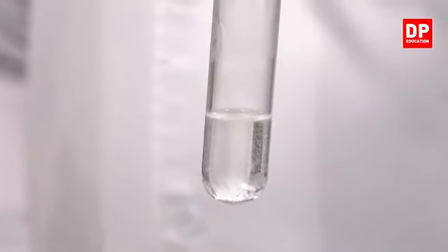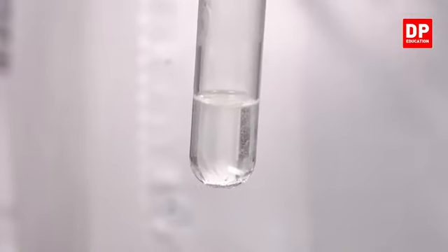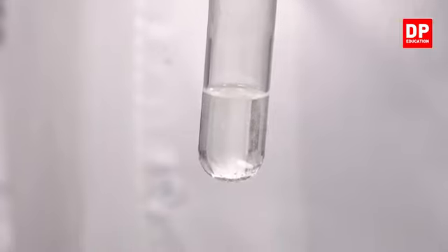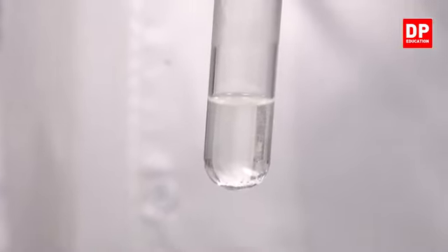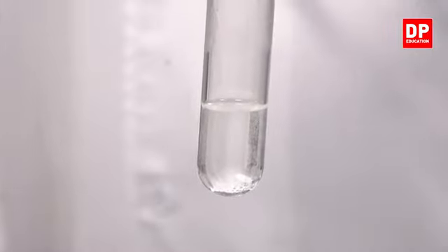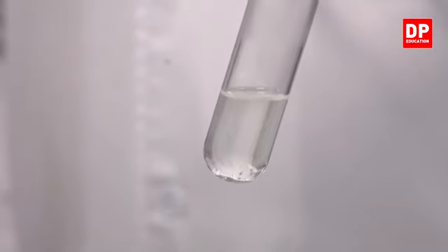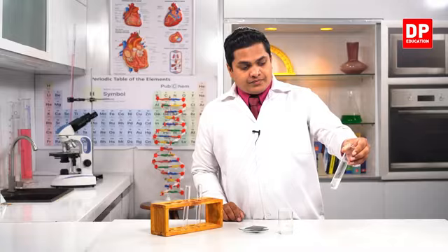Right, my dear children, now after a few seconds, you can observe the system is emitting gas bubbles much faster. See? So the system is emitting gas bubbles much faster right now. You can observe it very clearly.